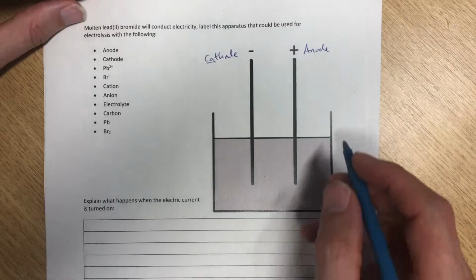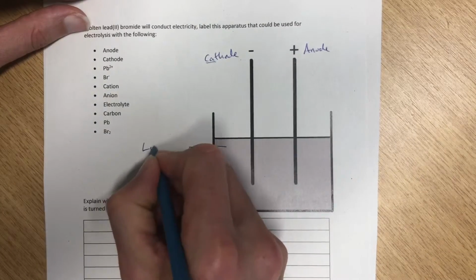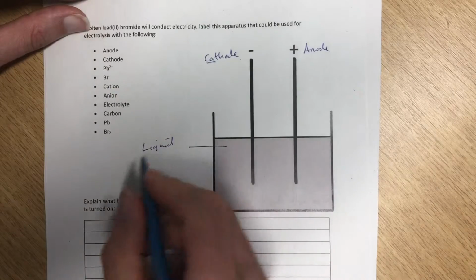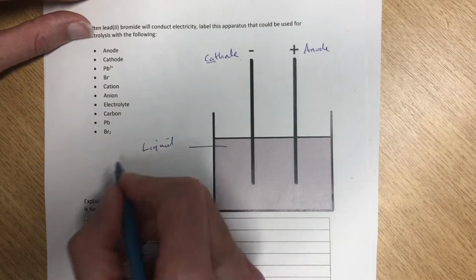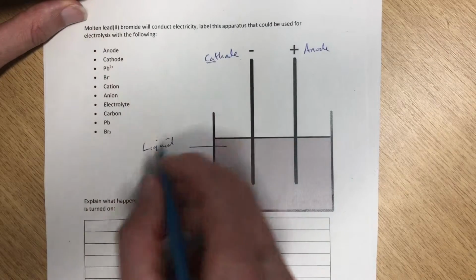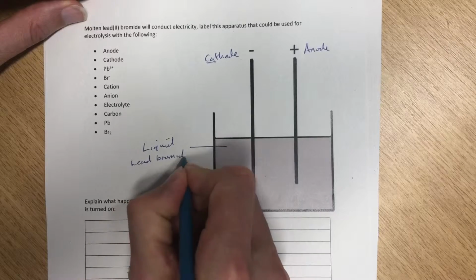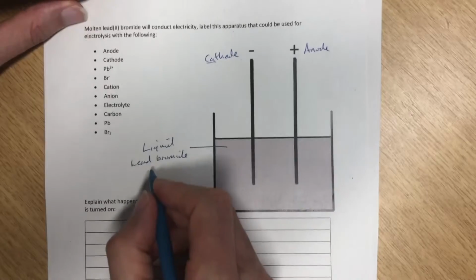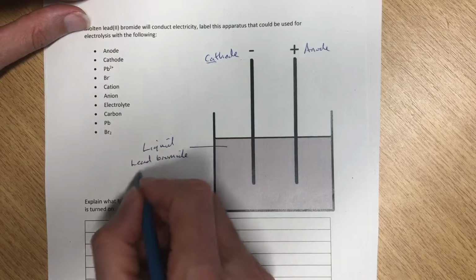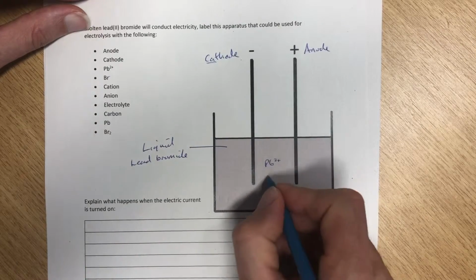Now, we put those electrodes into the liquid undergoing electrolysis. This has to be liquid. It will not work with solid. A liquid ionic substance undergoes electrolysis. In this case, it's liquid or molten lead bromide. So that's pure lead bromide, just been heated up and melted. So that would be made of Pb2+ ions and Br- ions.